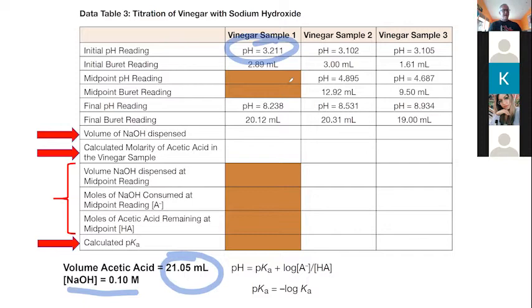So think of a burette sort of like this, but instead of a syringe pushing down, we just have a little stopcock on the bottom. We take this out, and when we open up the valve, it freely lets water come down. And they're normally much larger, normally holding about 50 to 100 mL. And they're very, very tall so that you can read the volume very, very accurately.